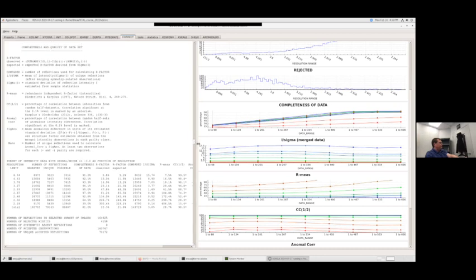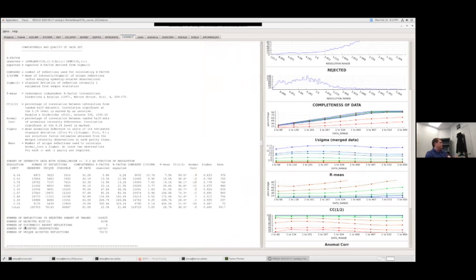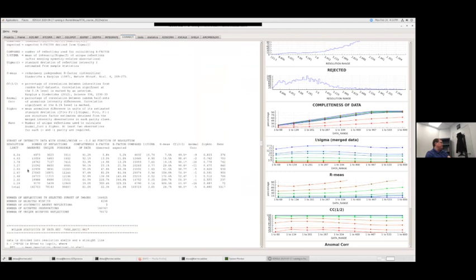And then if I make this over, so here what we have is the subset of resolution limit. The way that integration works is it looks at subsets, what they call shells, resolution shells. So this is the high resolution limit of the shell, and then the next shell up would start with a low resolution of that.